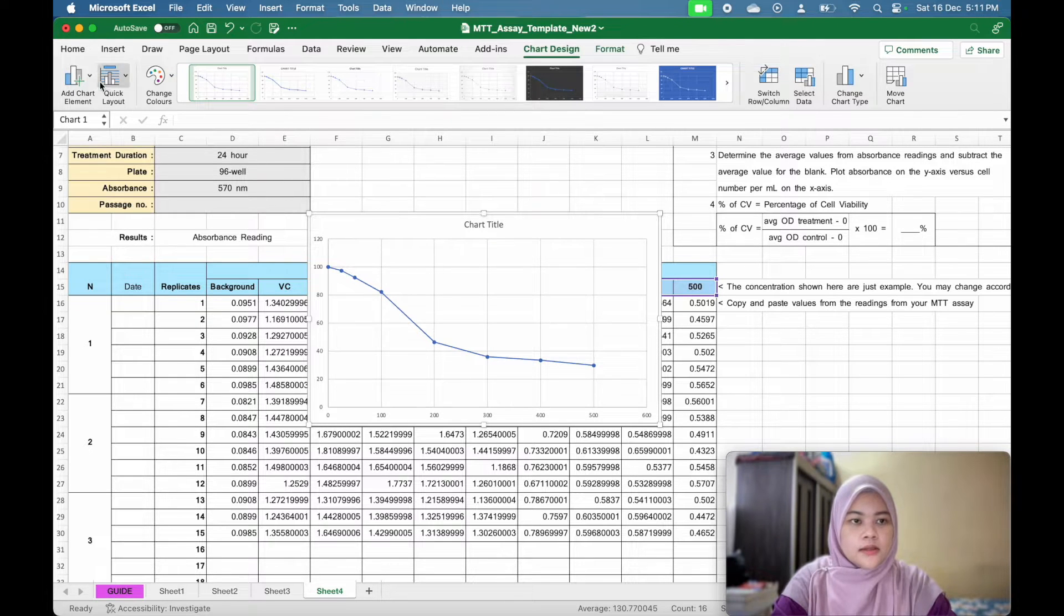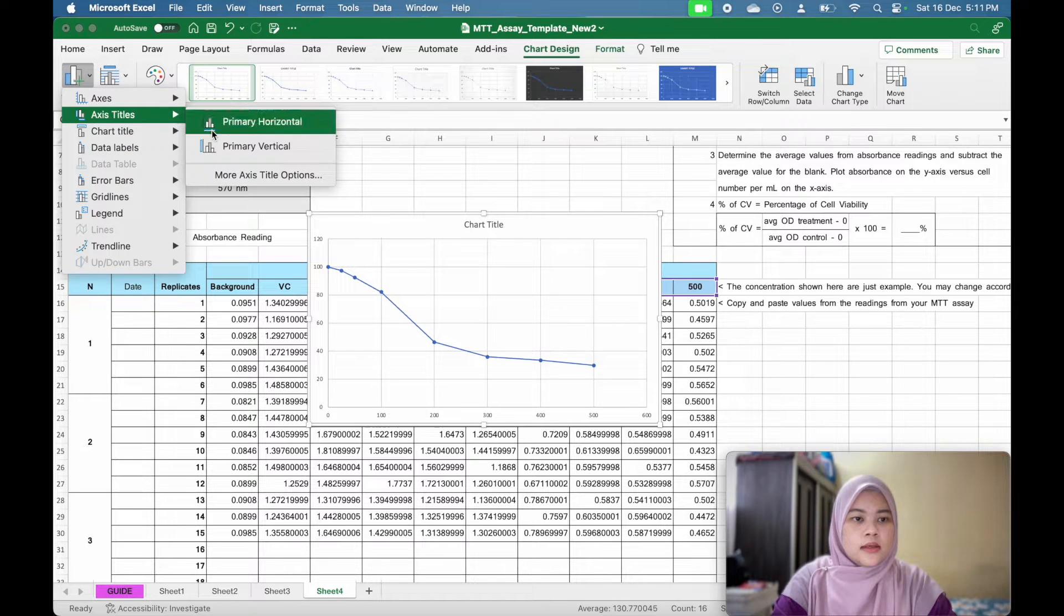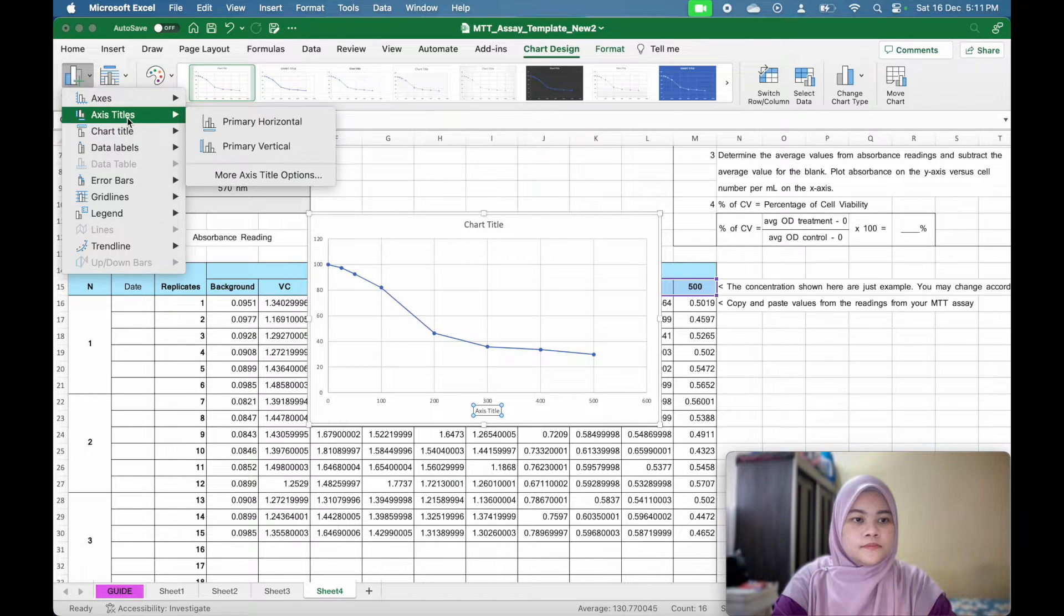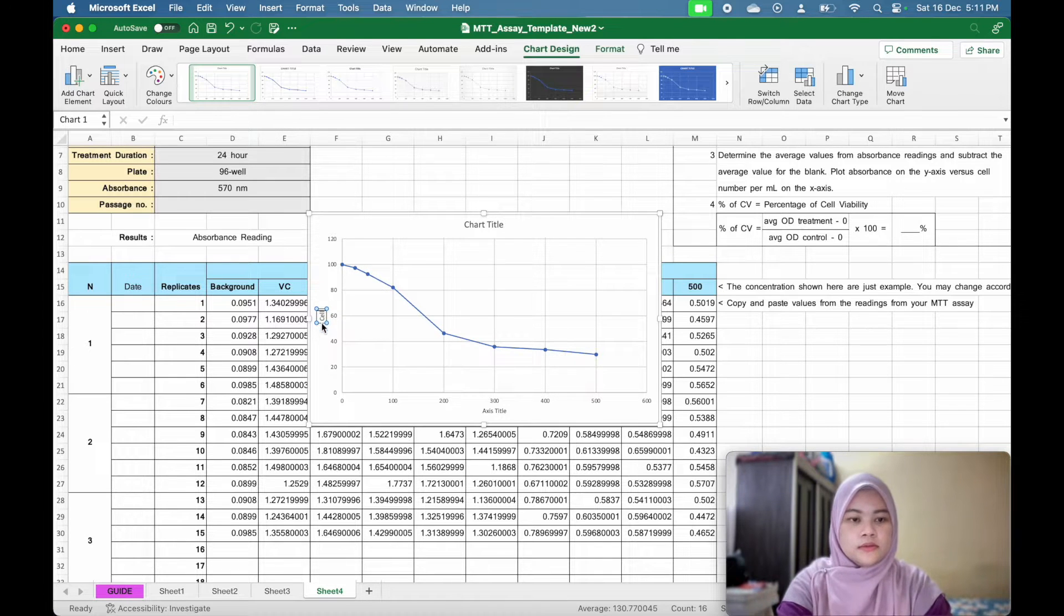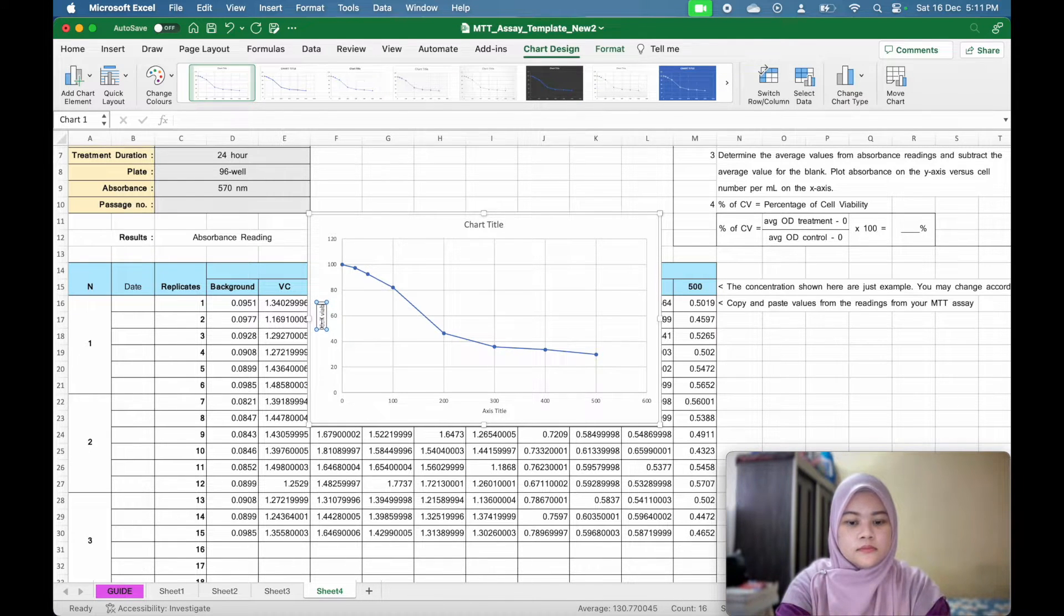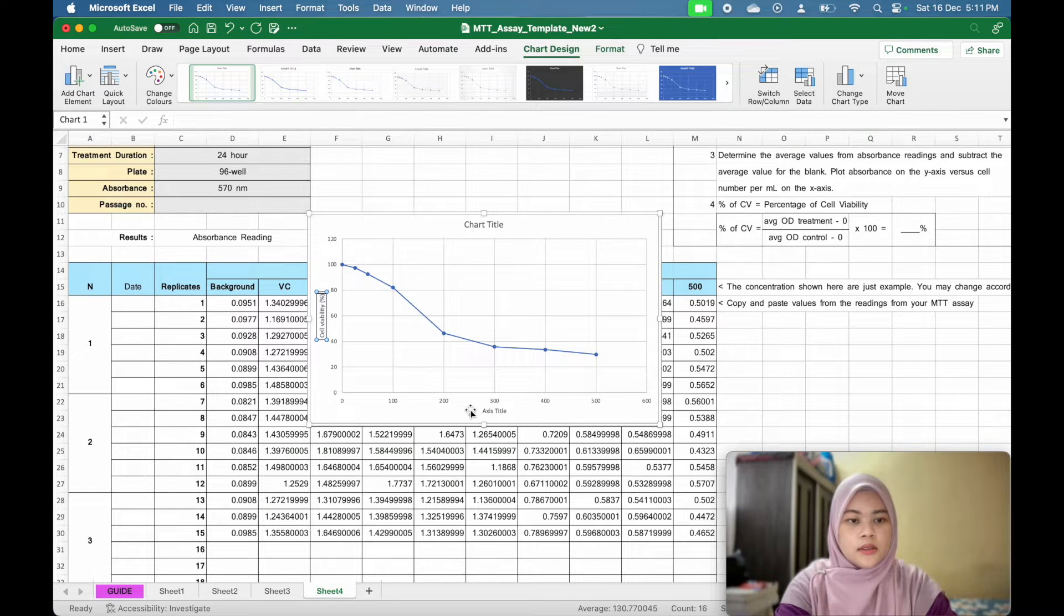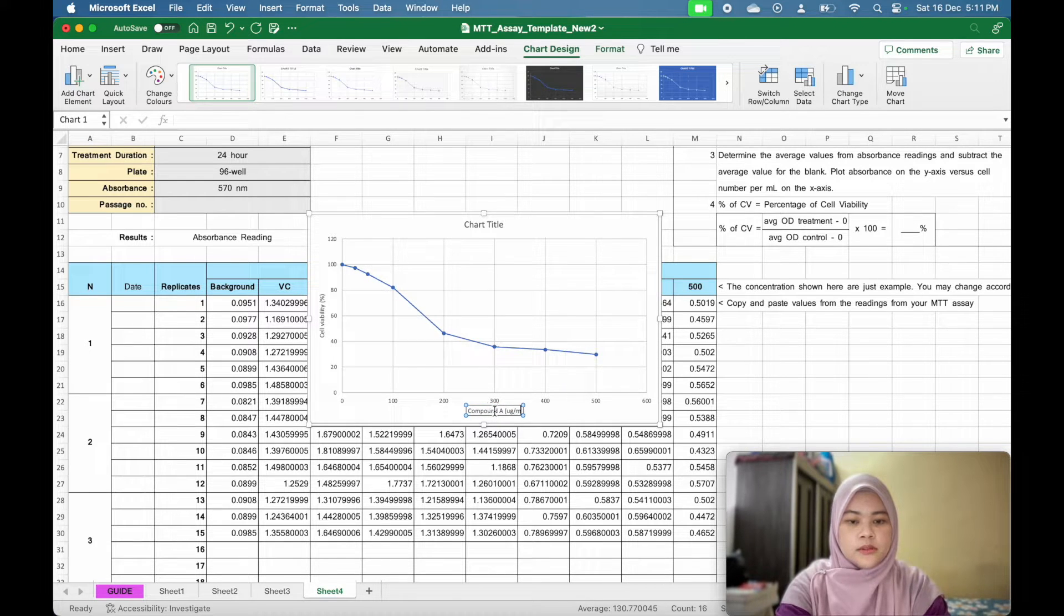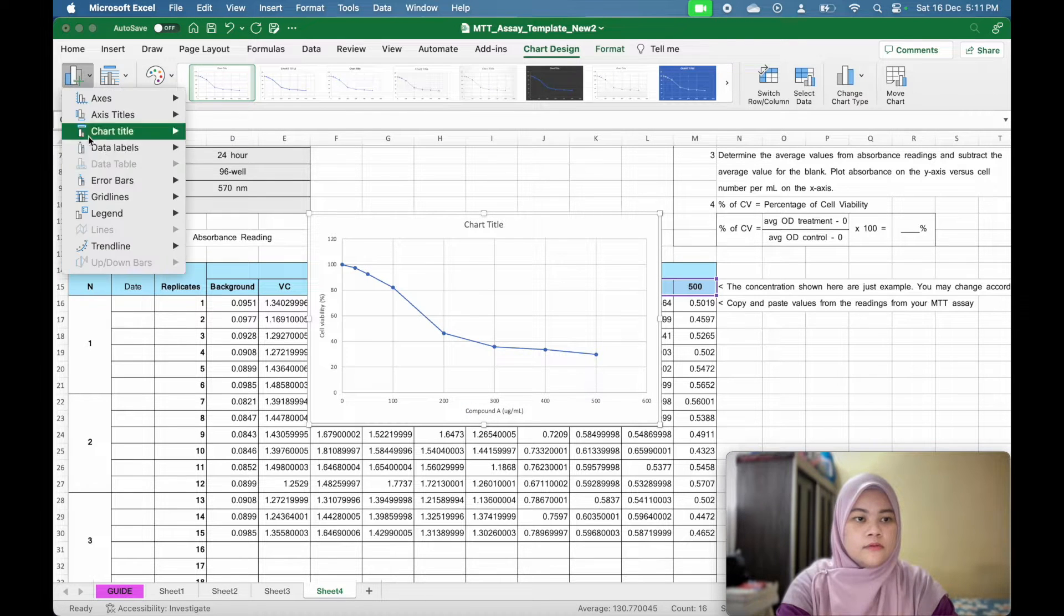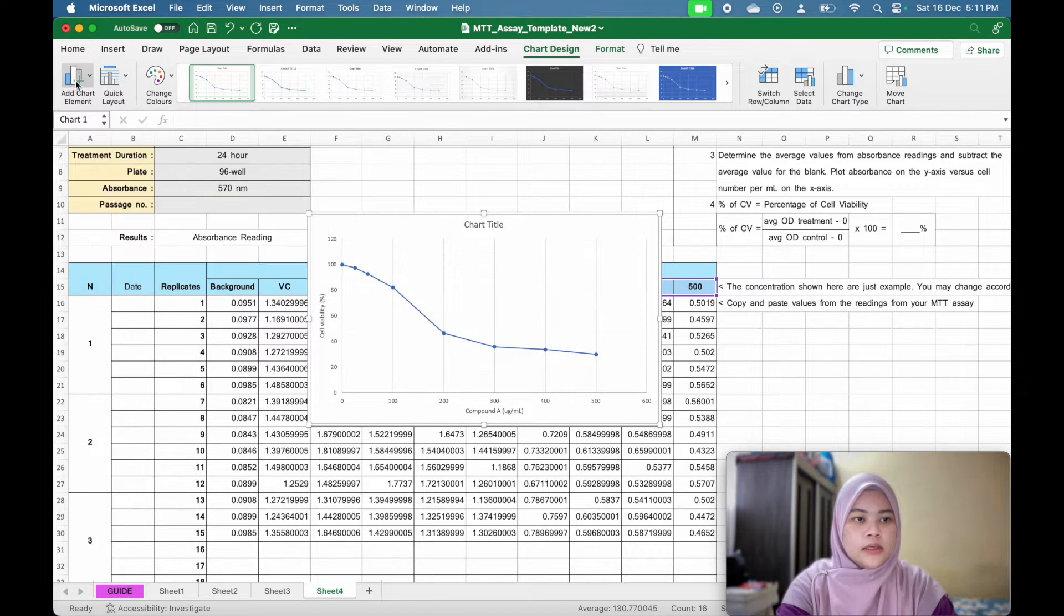You can edit this chart element. You can add the axis title for each axis. Now I get this graph and I can remove the grid lines.